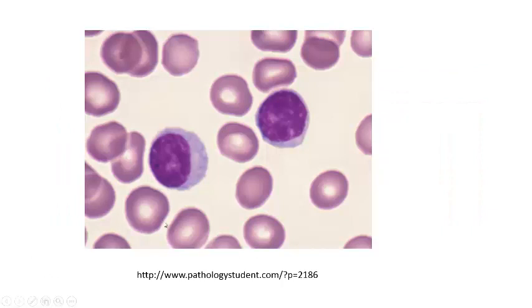And our last slide that we come to, this is a very short little presentation. We have lots of erythrocytes here, and notice how small they are. Large nucleus, small rim of cytoplasm around each. So yes, you got it. These are lymphocytes. Very good job. And we are done.